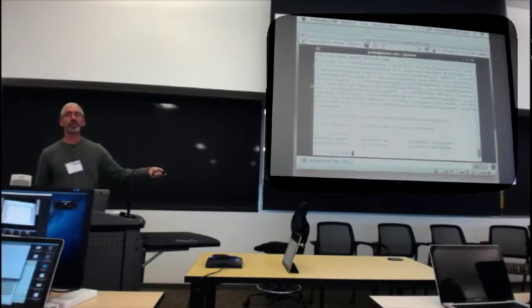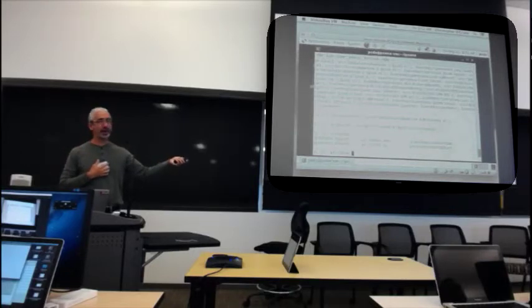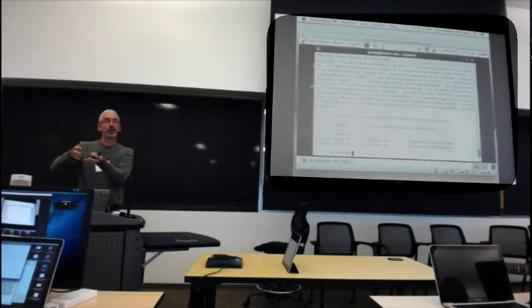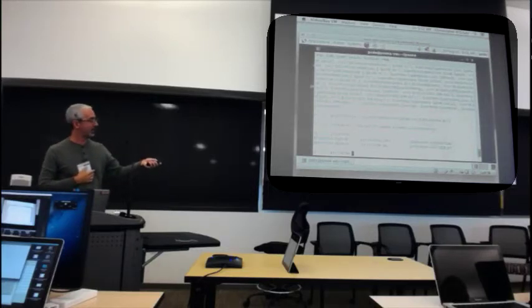And you can do this with a CSPad. CSPad's a complicated device. There's a hierarchy of stuff. You can go get the CSPad object, and you start hitting tab, and you start to see the layers of the onion. You know, you see something that gets you a quad. Then you go get the quad object, and then you hit tab again, and you can go see inside the quad are these ASICs. And you can go and get all the CSPad data without reading documentation, by just taking some judicious guesses.